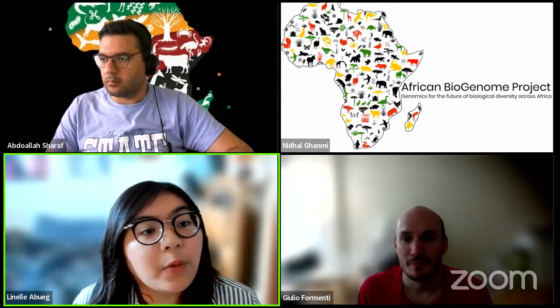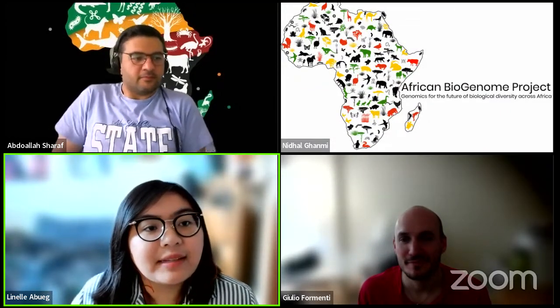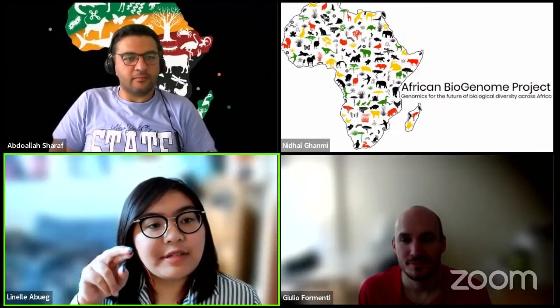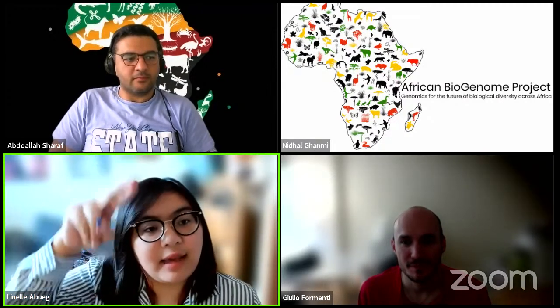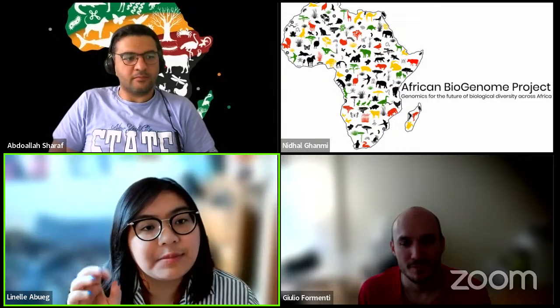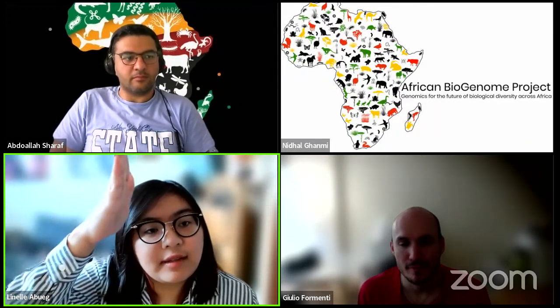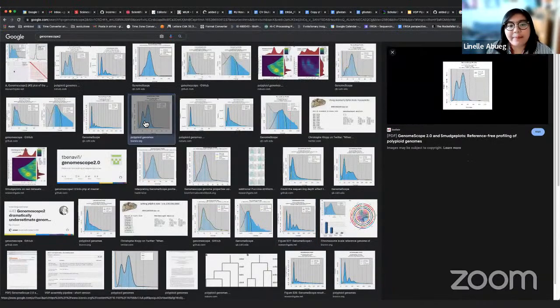Okay, go ahead, please. I'll address the height one first. For the diploid, if you remember the zebra finch one, the haploid peak was a lot higher. That means there's a lot more heterozygosity, so there are a lot more differences between the two parental haplotypes. If the haploid peak is lower, then you'll have fewer differences between the two of them.